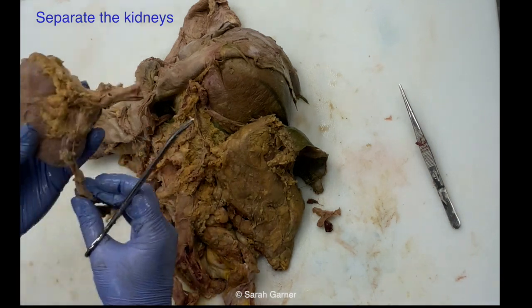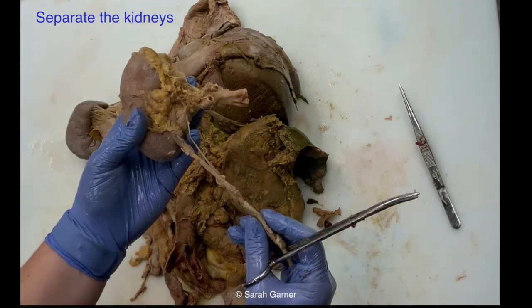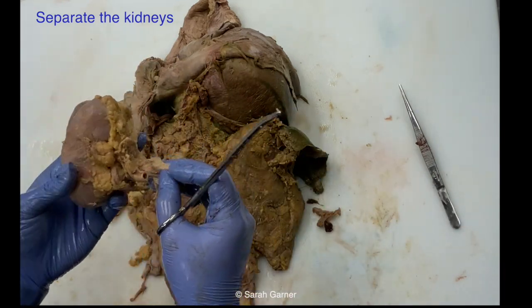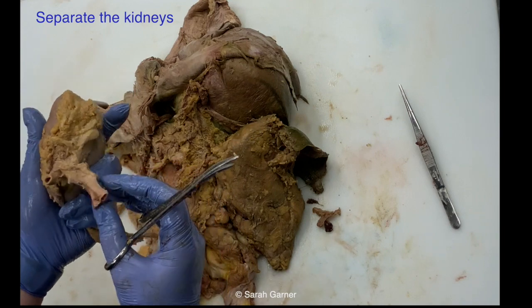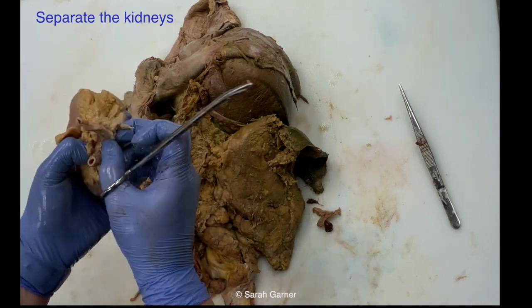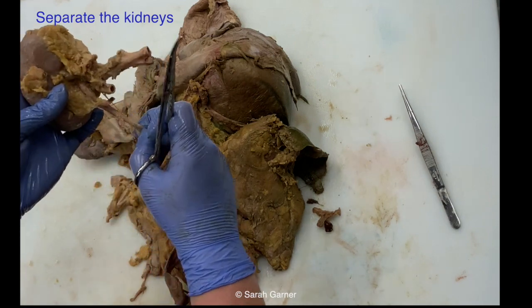Okay, so this is our left kidney. Again, make sure you're keeping them separate so you know which side is which. Now you're gonna weigh this. If you're about to weigh this, you should make sure that your fat's off and that your vessels are trimmed to the hilum. Same thing with your ureter.